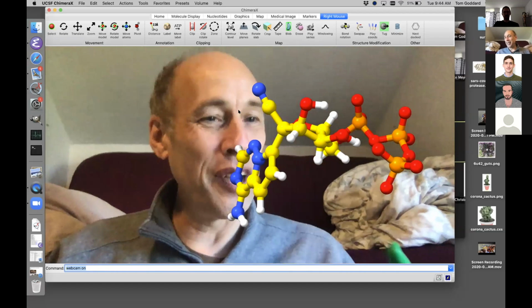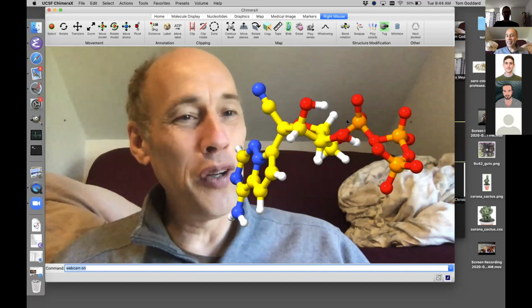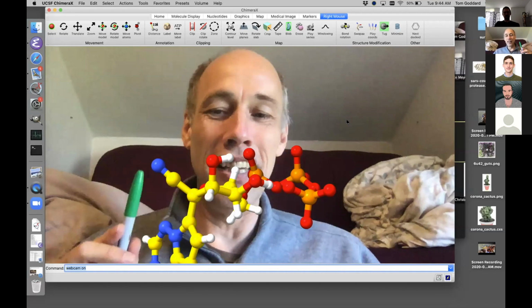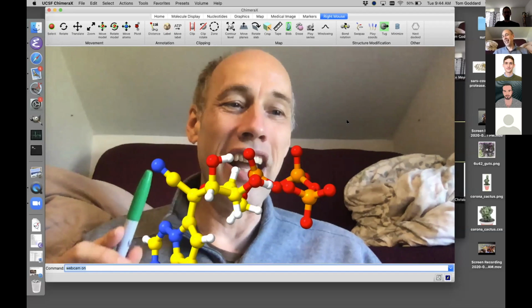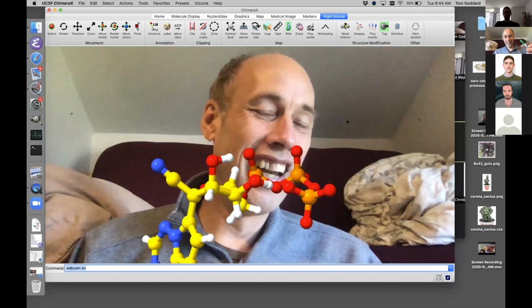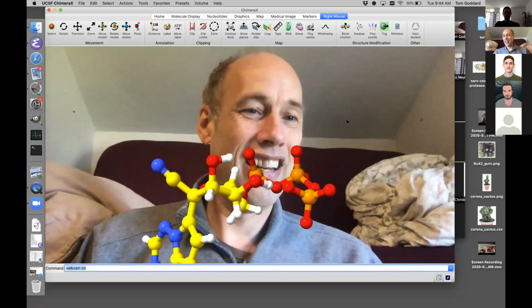This is all brand new, and that may still be a better approach, and there may be some trick to avoid that. But what I found is that if I do this kind of ugly thing and plaster it right over my face, maybe I could put it a little lower, then it actually looks like I'm looking at this nitrogen when I say this nitrogen. And that helps communicate. That gets right to your point about the human nature of it. You're present, interacting with someone, they're showing you something in person almost. You have this human expectation that their eyes are going to match what you're looking at.